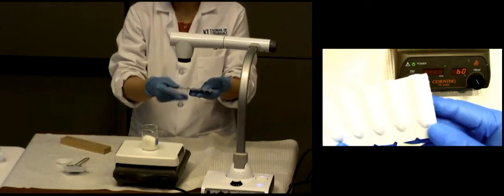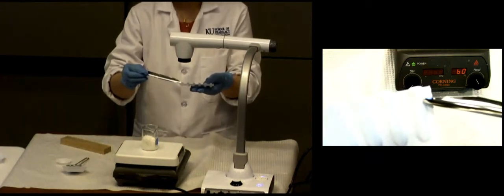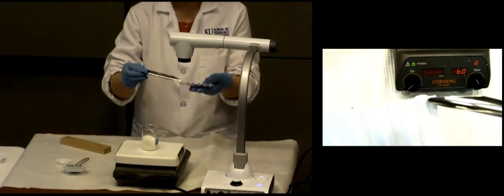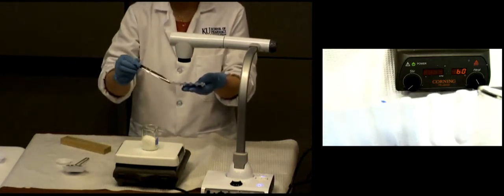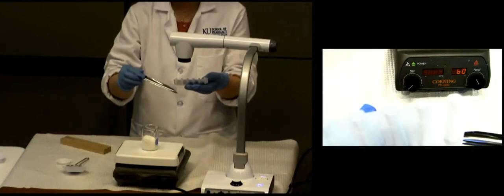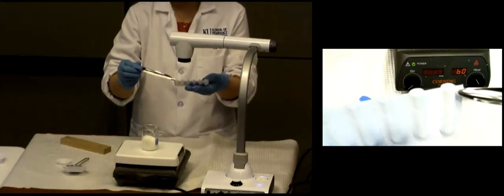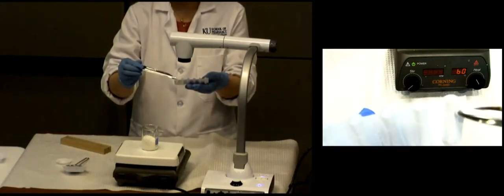Anyway, the point here is hopefully you guys can see that there's a line here. Okay, so that means on the top here is the overfill. All right, therefore when you pour your suppository liquid in there, you do not necessarily have to overfill all the way to the outside. You only need to pour somewhere close to the top because, oh, that looks better. Did everybody see the line there? So this is your overfill.